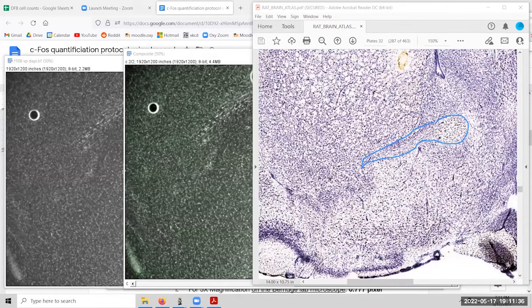We've got the pyriform cortex located over here, this dark band. And that is probably what we're seeing over here. This is pyriform cortex, as far as I can tell. That would mean that we also have another part over here, a white matter tract that's a little bit off to the side, and that would probably be about here. And so we're starting to put some of the pieces together.